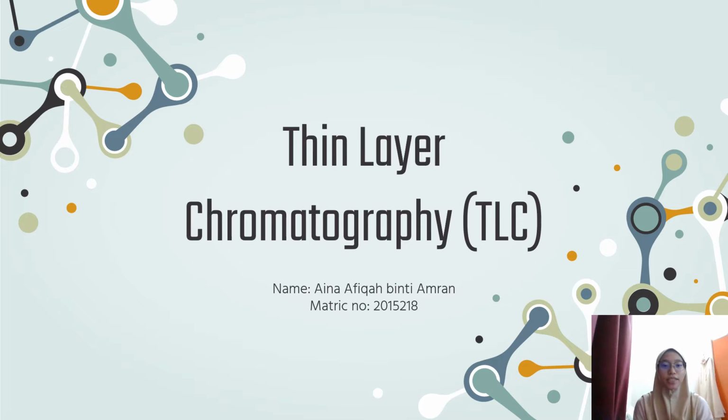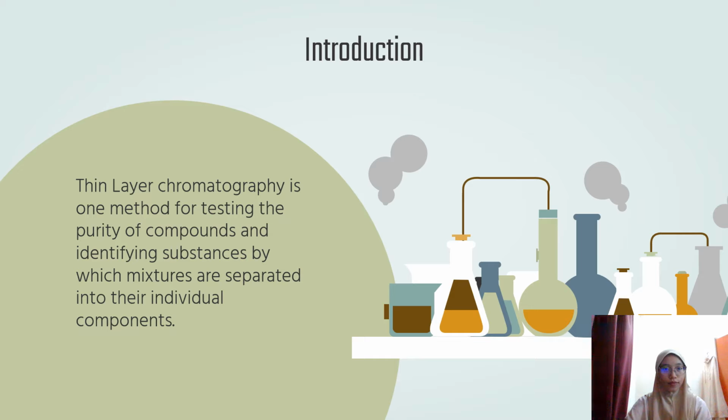My matric number is 2015218 and I will talk about thin layer chromatography. TLC is a simple, quick and inexpensive procedure that gives the chemist a quick answer to how many components are in a mixture. Thin layer chromatography is one method for testing the purity of compounds and identifying substances by which mixtures are separated into their individual components.